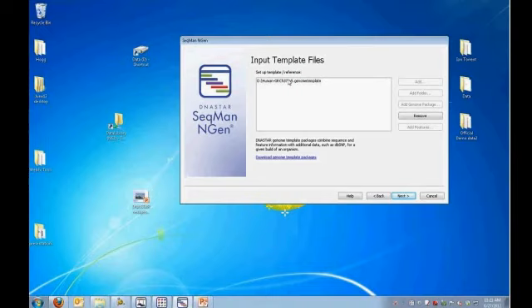You don't want to run a SNP report or try to generate a SNP report on your laptop on a human genome. It could take hours or days just to generate that report. So we'll generate SNP files as the data is streaming through to tell you which SNPs hit at dbSNP locations and to start applying p-values and statistical measures.